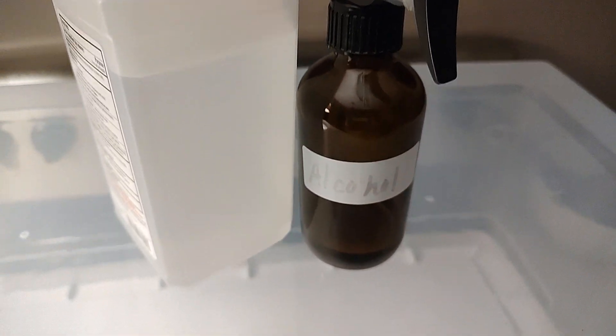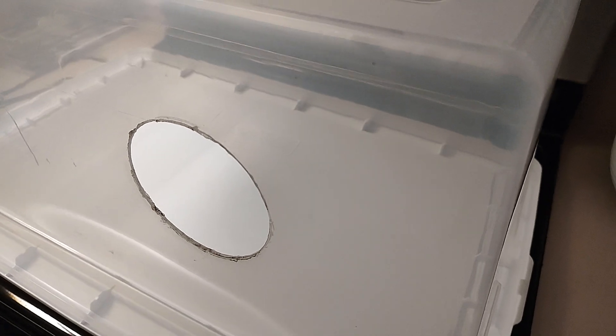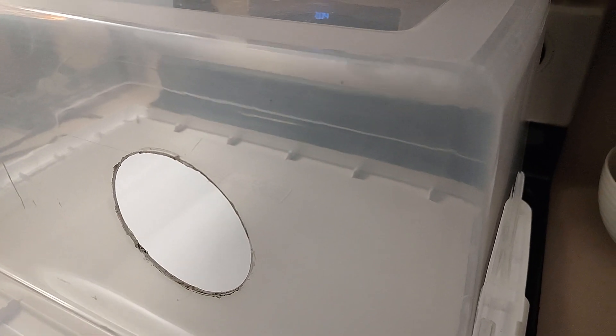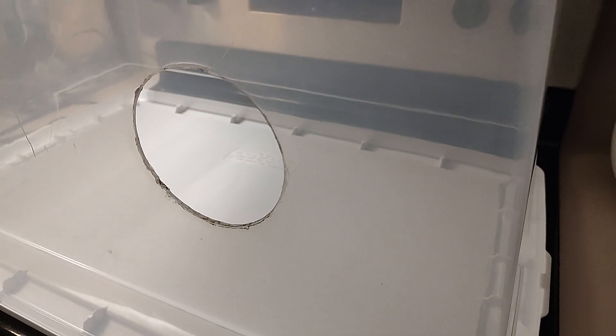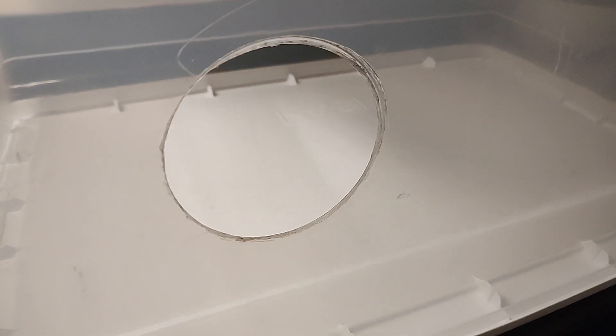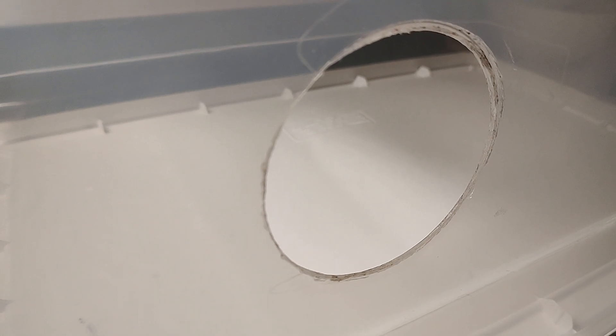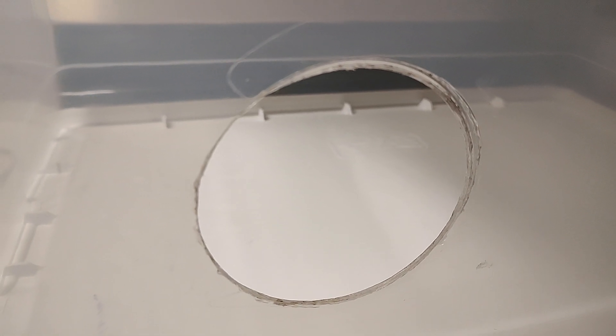Hello friends! I have our still air box in the kitchen and I thought I could show you what the husband created for us for cloning tasty mushrooms and transfers during the cloning process when working with agar and liquid cultures.